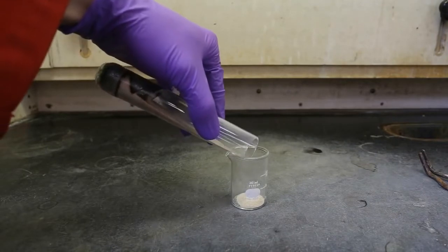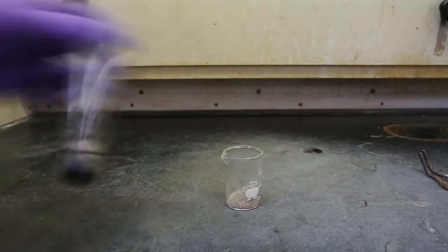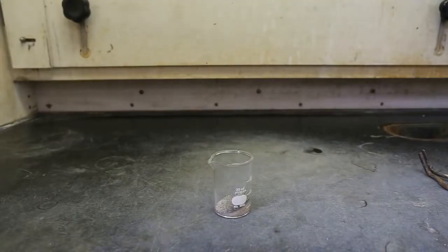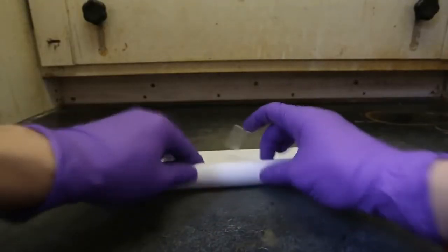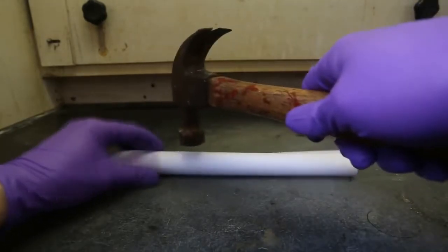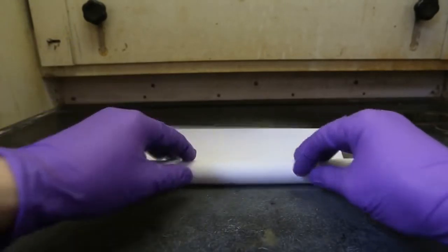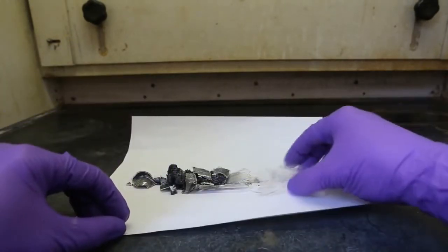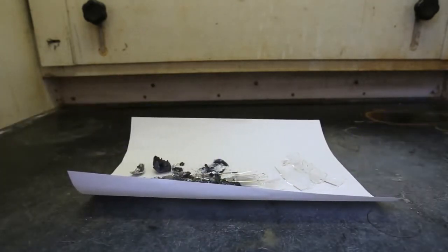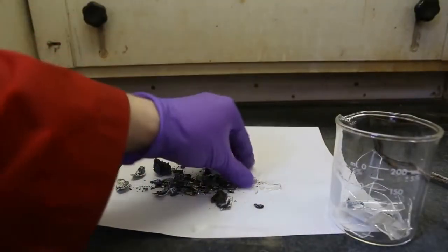Next, if you use sand, pour out this unreacted sand into a beaker and dispose of it. You could also simply use this sand if you plan to do the reaction again. Next, roll up the test tube in a piece of paper and tape it to keep it from unrolling. Lightly tap your test tube with a hammer just to break the glass apart. Unroll the paper and then start picking out all the broken pieces of glass. You are only trying to remove the big pieces of glass, so don't worry if you leave small pieces of glass behind. The dark black bluish material that you see is actually the magnesium silicide.